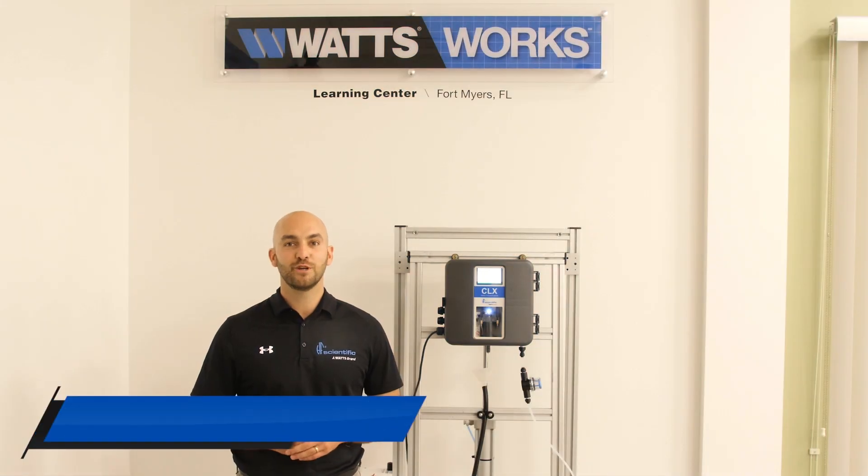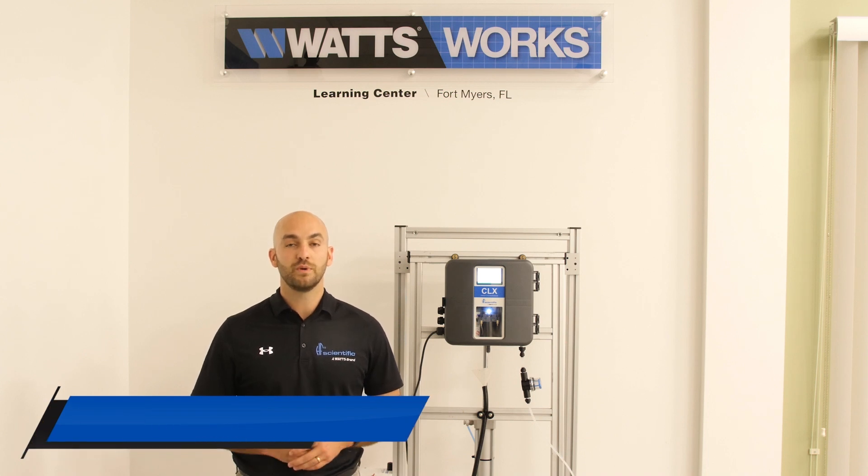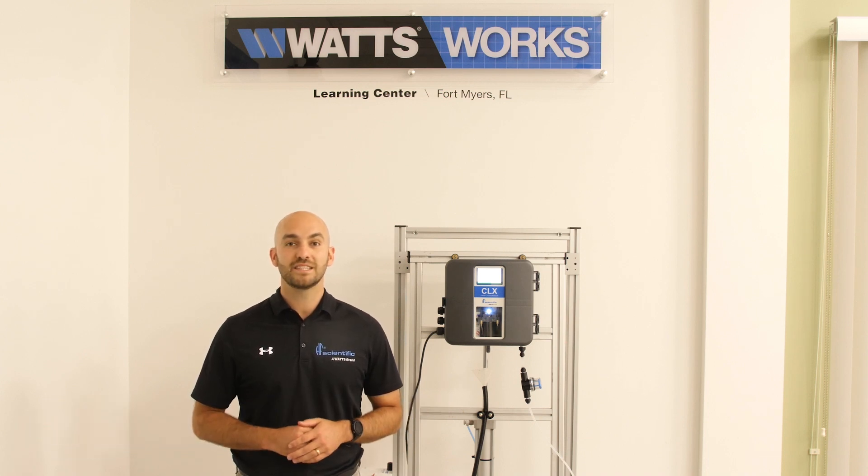Hi, I'm Eric Dibble, Regional Sales Manager at HF Scientific. In today's video, we will be going over the setup and installation of the HF Scientific CLX Online Chlorine Analyzer.